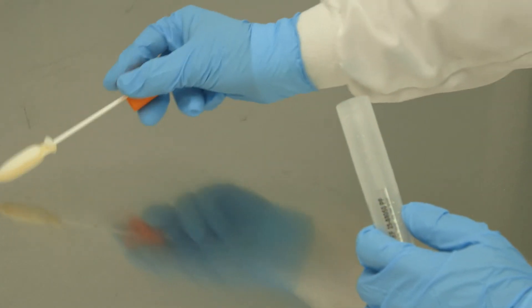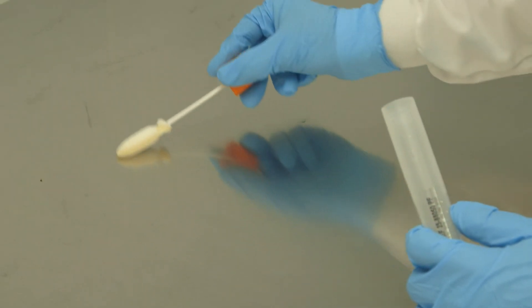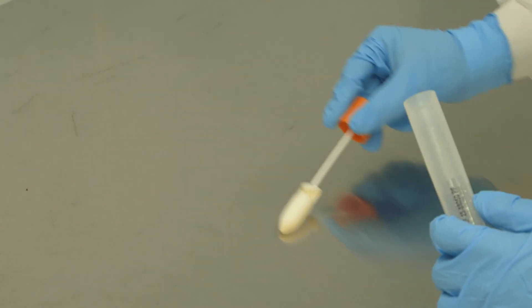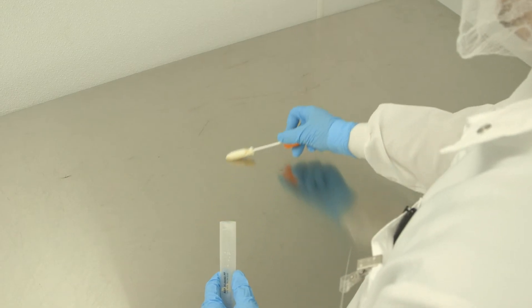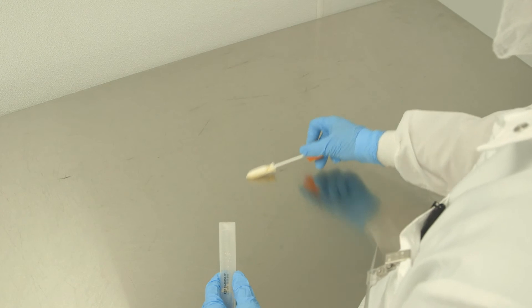Swab diagonally using the same swab surface side as used in the vertical swabbing. Swab approximately 10 times in the sampling area until the opposite side's bottom corner has been sampled.